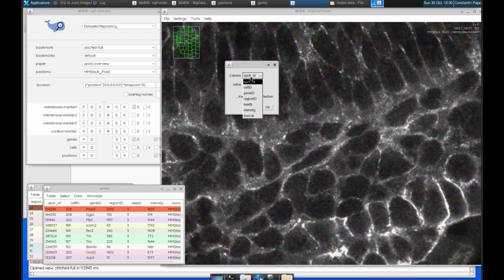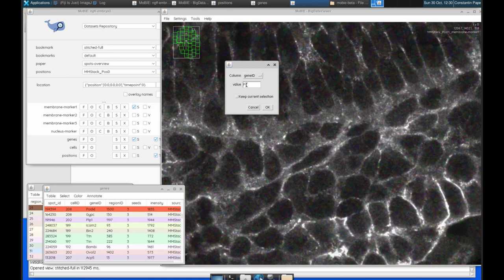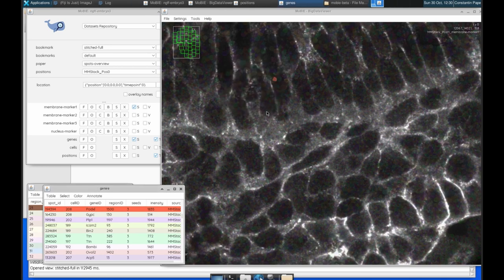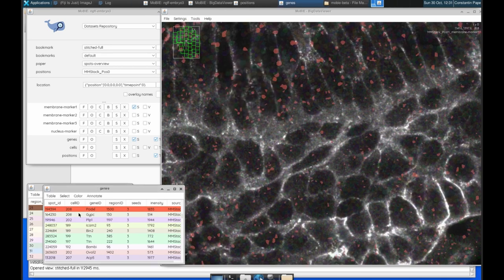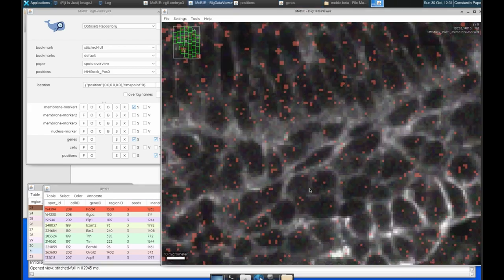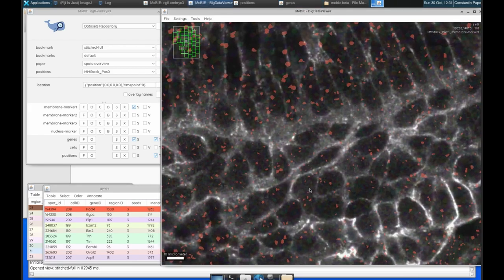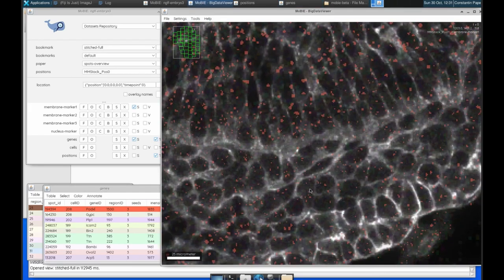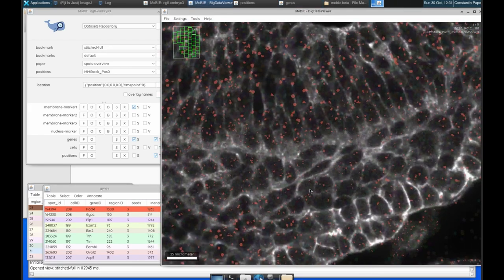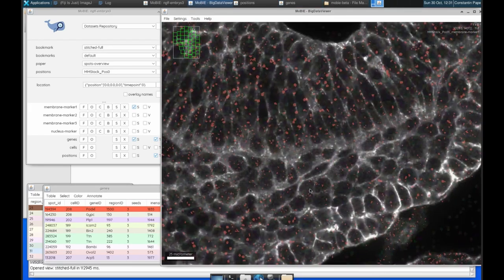So we can again select the gene ID, type in that specific gene name. And then we can click OK. So now every single spot that has that gene ID is shown in that same brown colour.